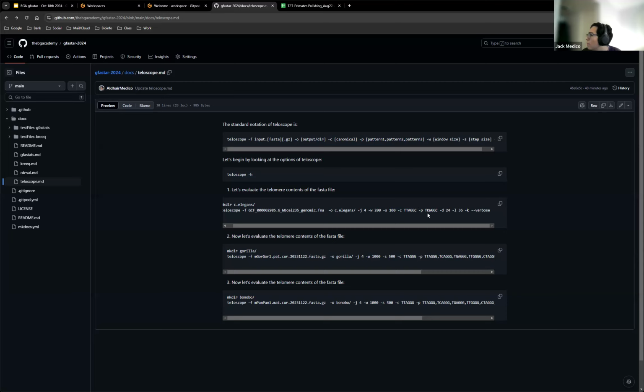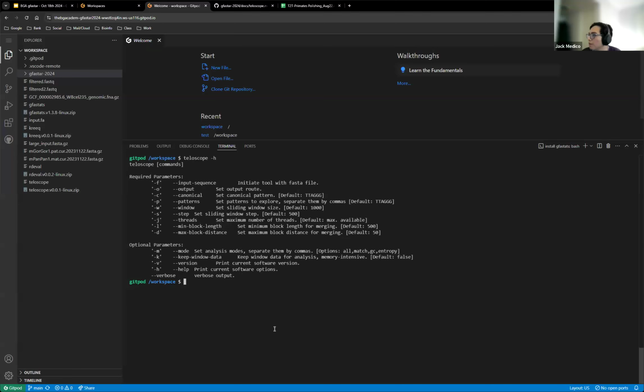Because I don't want to type a lot of different repeats, I will use TKWGGC. K represents multiple nucleotides, the same for W. And I will use a short distance and a short length cutoff just to see what it looks like.